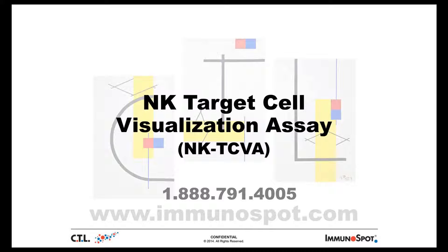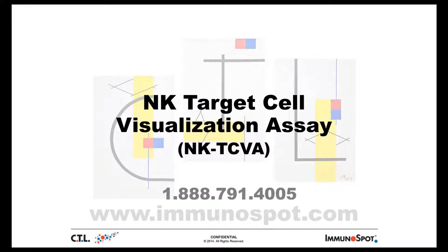This is a demo of the NKTCVA application in the CTL cell counting software. The software is optimized for high-throughput image analysis of individual target cells via fluorescent detection.